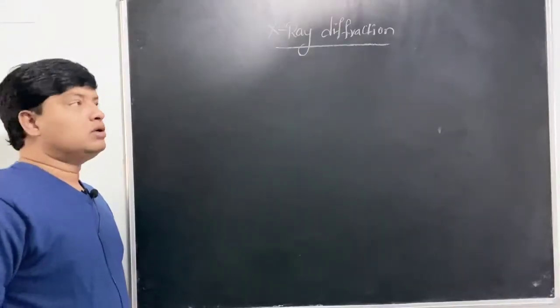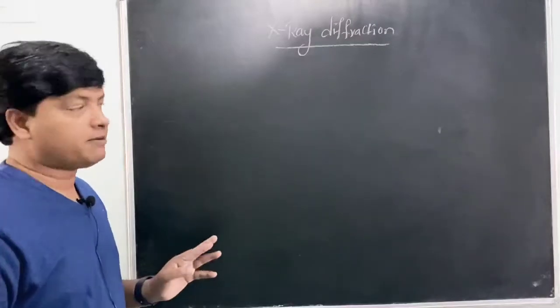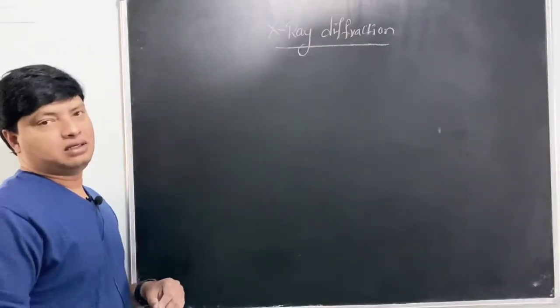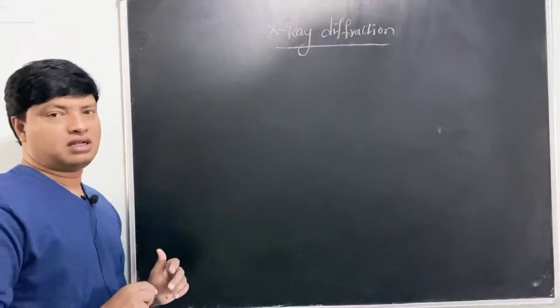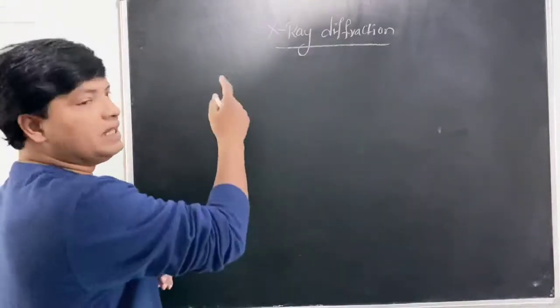Hi, today we are going to study X-ray diffraction in short form related to pharmacy. So, if you want to analyze a crystal, then you need to take X-ray. You need to project X-ray on the crystal. Then you need to analyze it. So you can ask me, sir, why only X-rays?